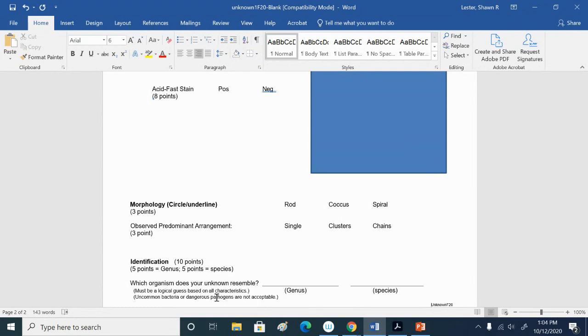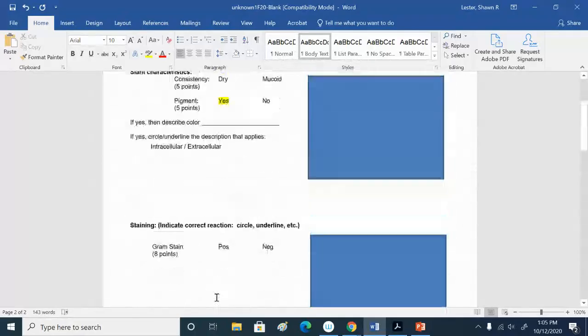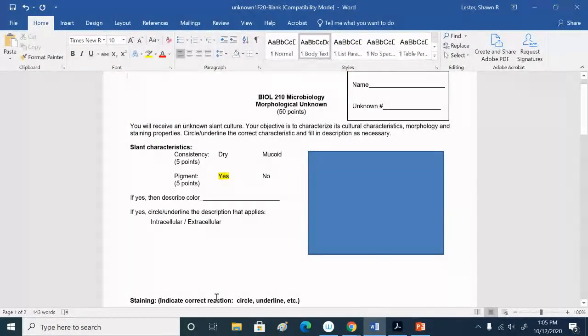So you would do all your work, make all your smears, examine them in the microscope, make observations of the growth, and make a guess as to what it was, all in a 2-hour lab period. So I'm going to give you till tomorrow night. So that's a lot of time, and this is much easier than the way you would normally have to do it. So any questions? So the pictures are all the same organism? Yep. Okay. All the pictures are just for one organism. Okay, got it.